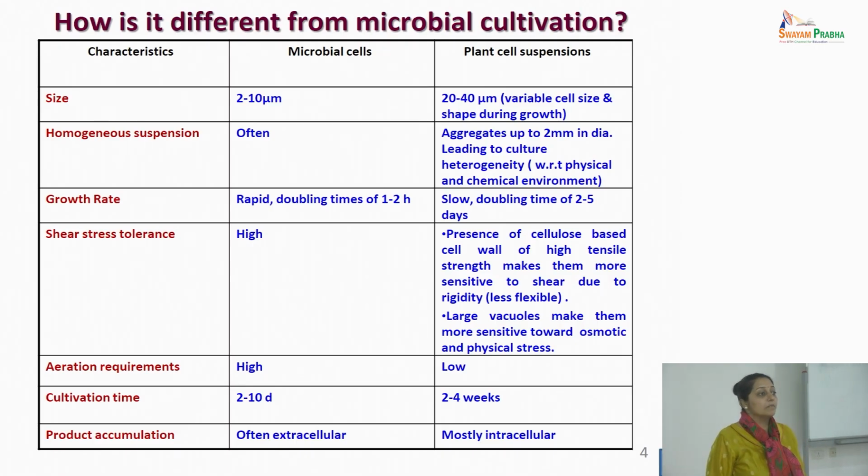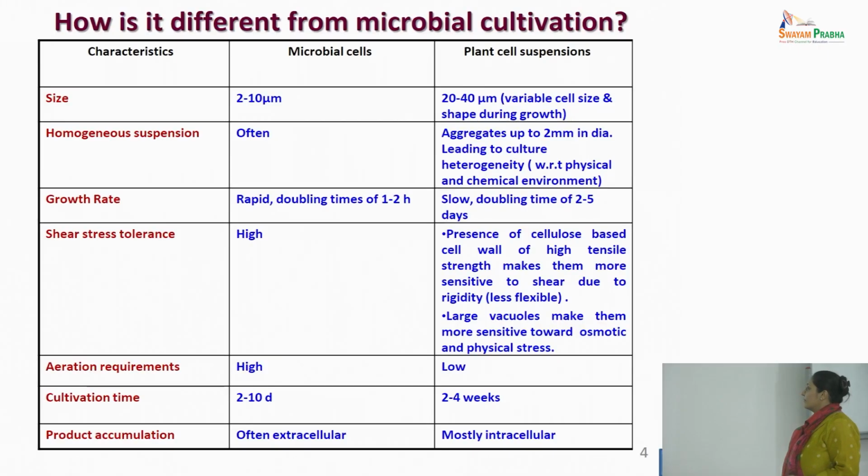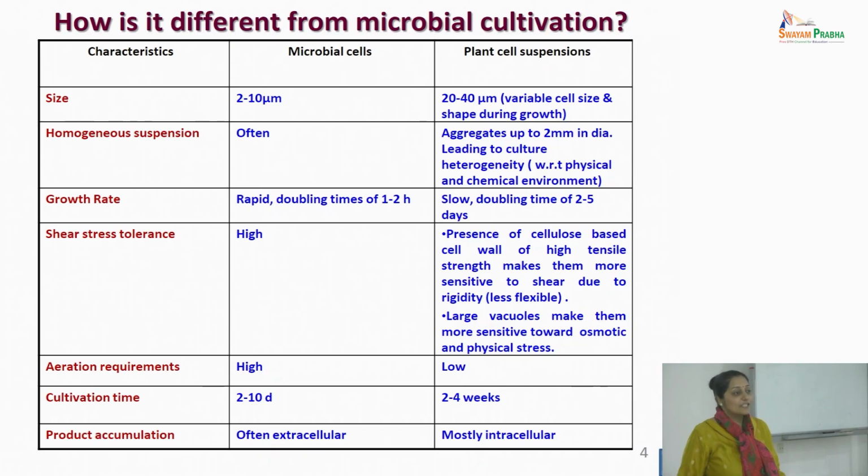If it becomes large production scale reactors like 200,000 liter reactors, if it is a very high aspect ratio and a photobioreactor, everything will become a challenge. So make note of the long drawn fermentations, the sterility requirements, the making of the reactor, the cleaning of the reactor, how will you harvest the biomass, how will the cleaning happen, how will you re-sterilize it.